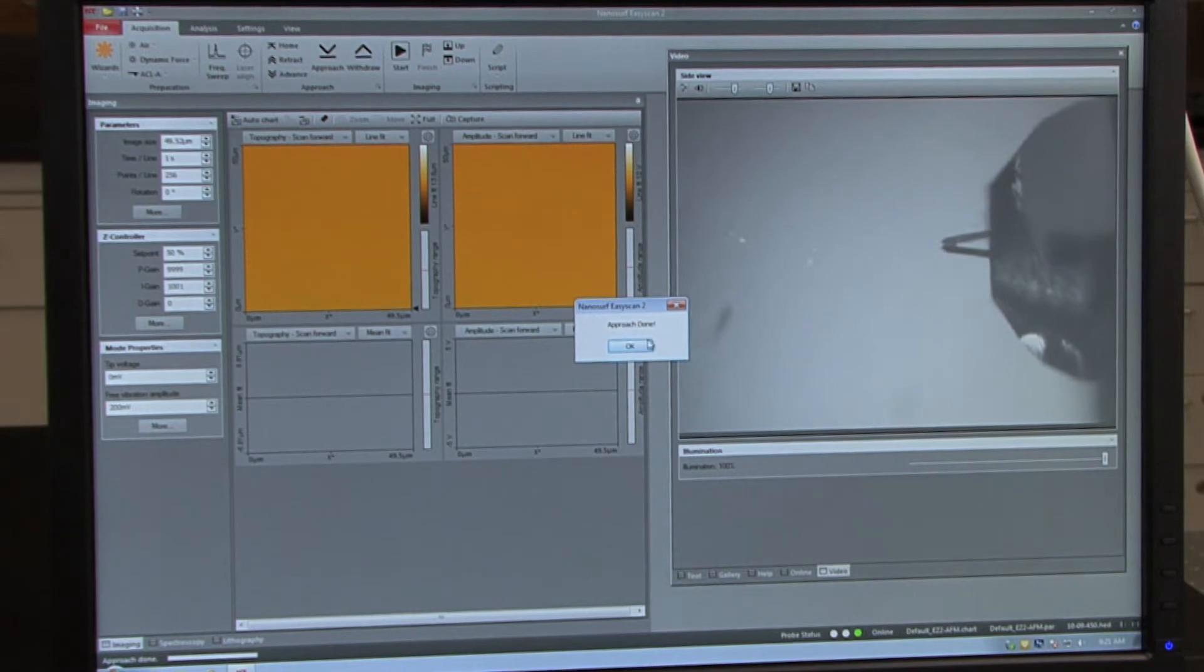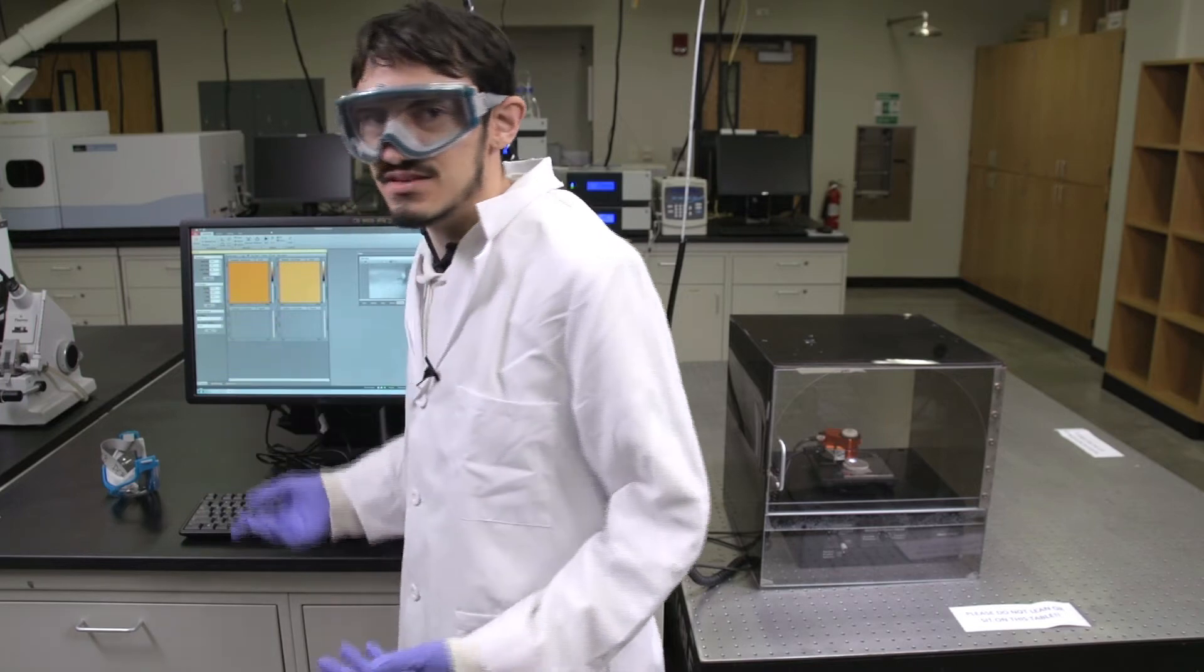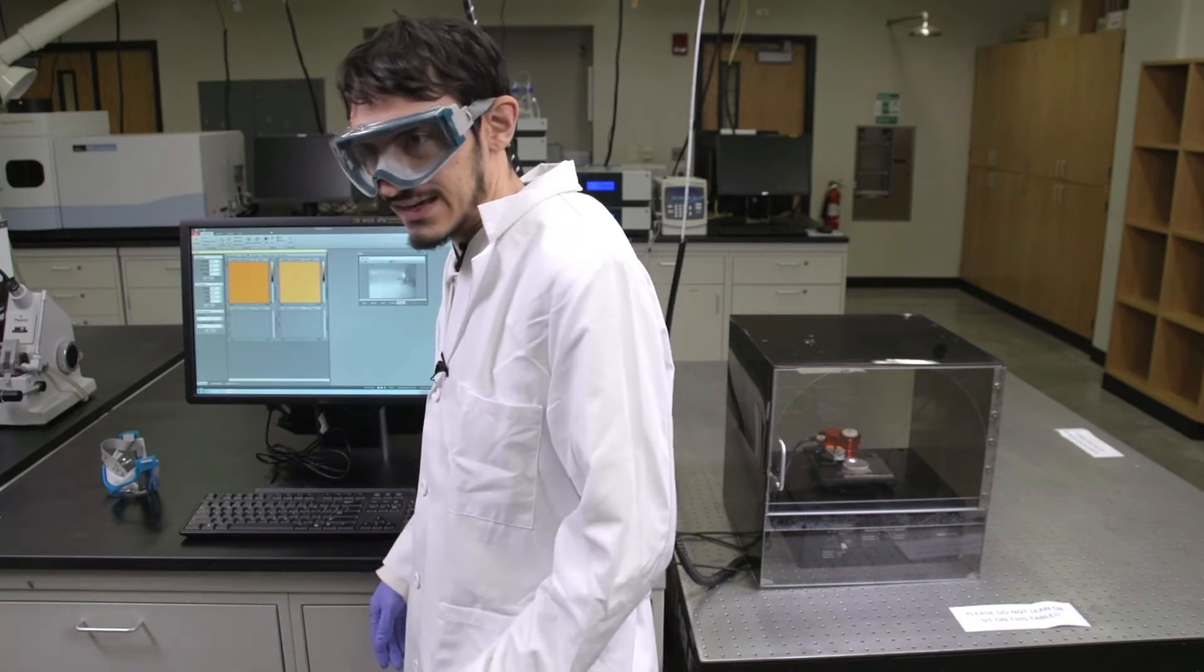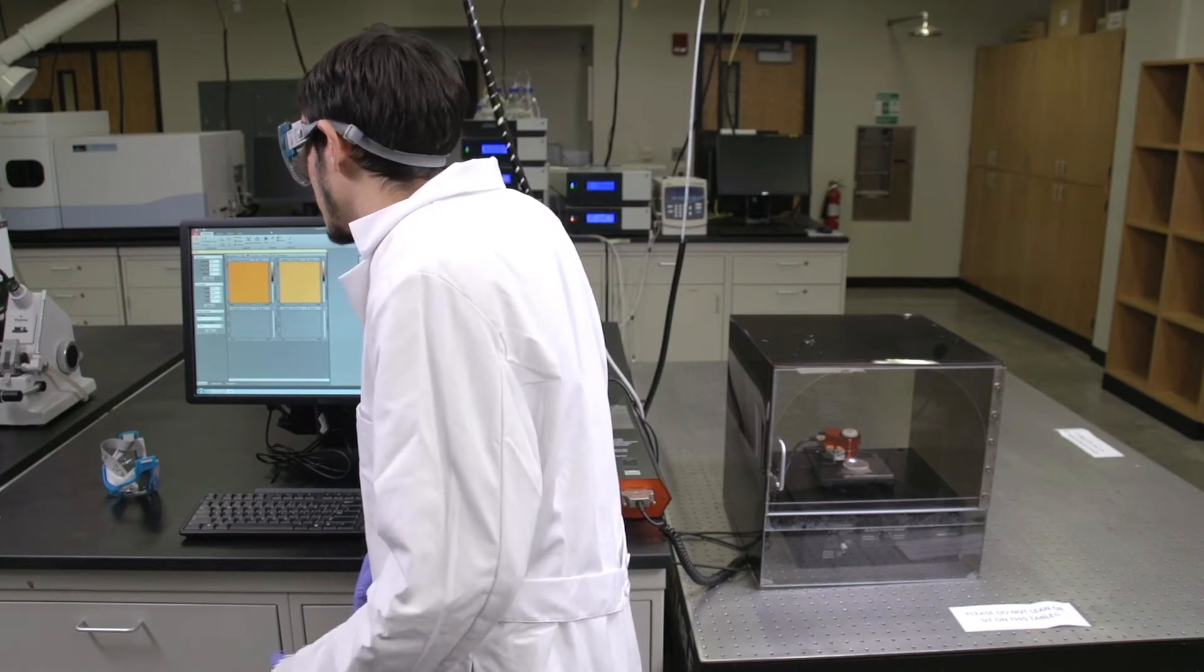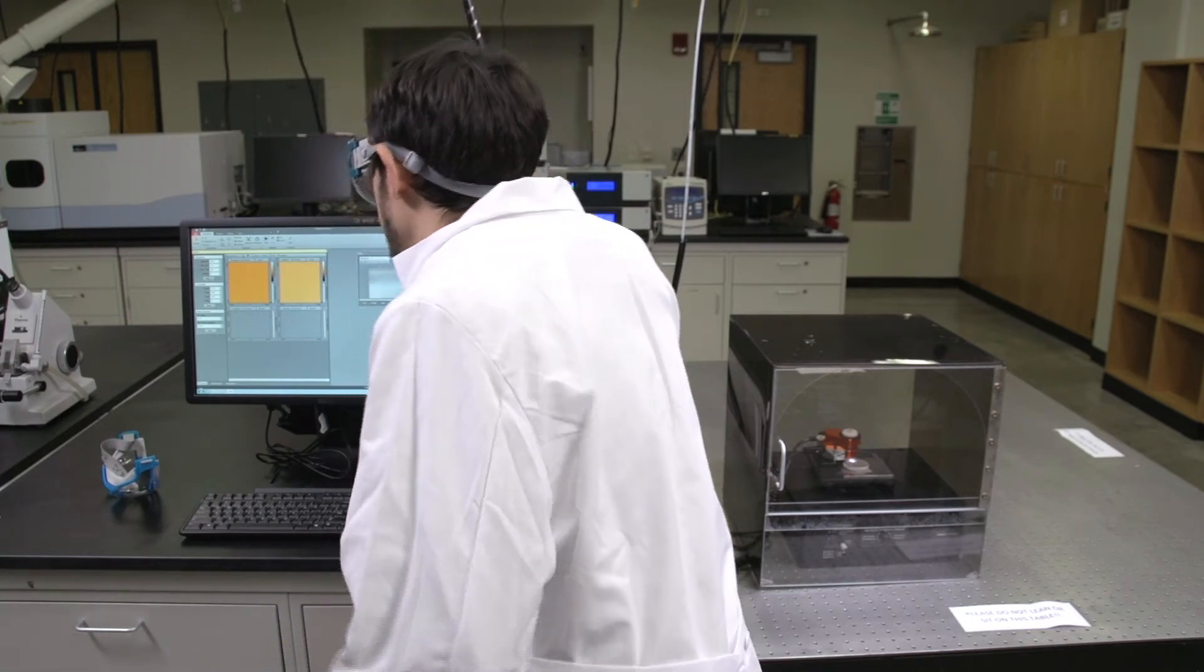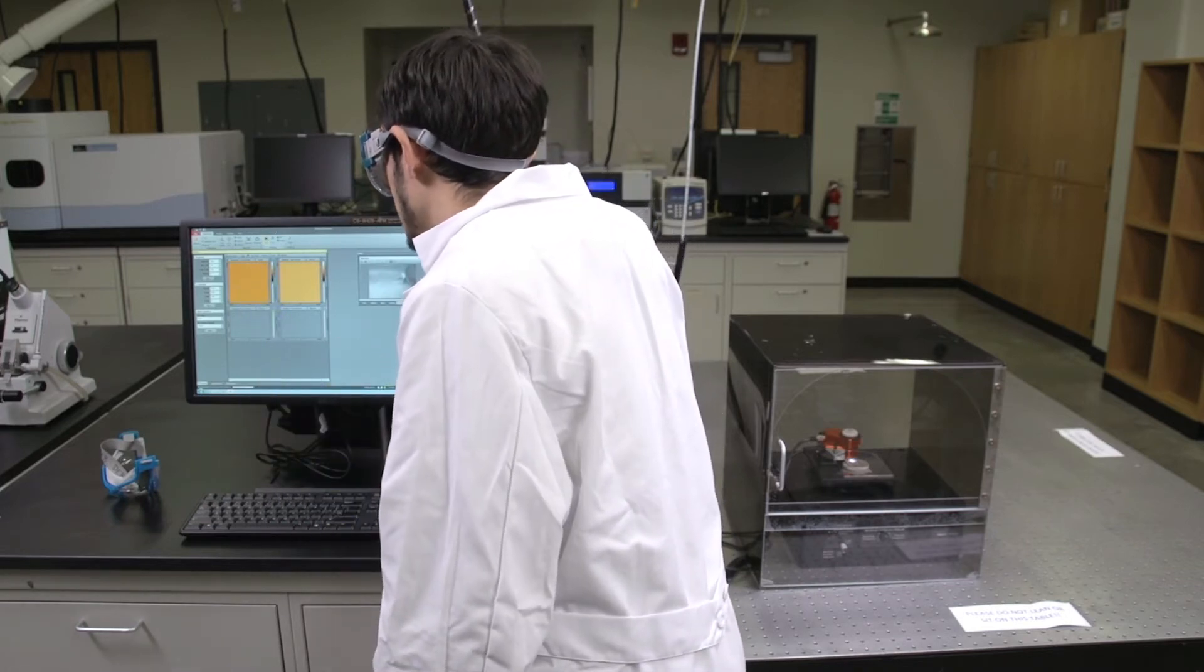Once the approach is complete, click OK and you are now ready to begin imaging. Prior to clicking start to take the image, be sure that the image size is set to 50 micrometers, that the time per line is set to one second, and that the number of points per line is set to 128. Once these parameters are set on the left hand side of the software, click start to begin imaging.